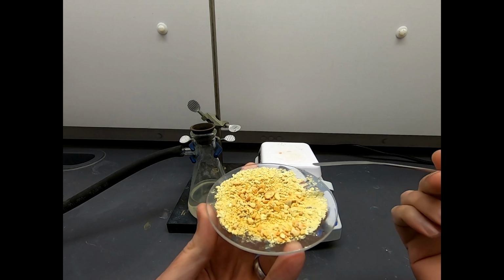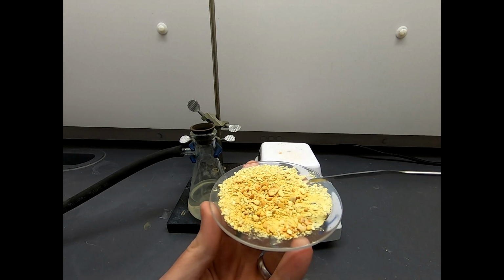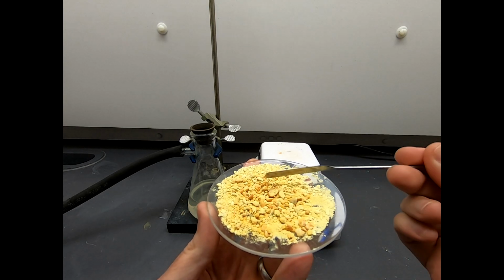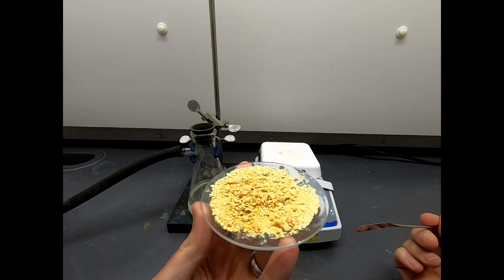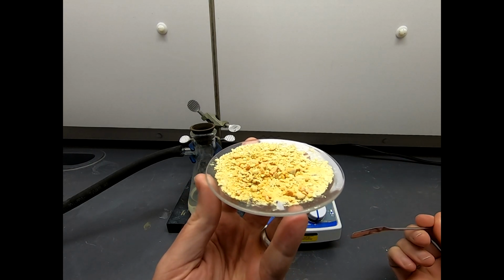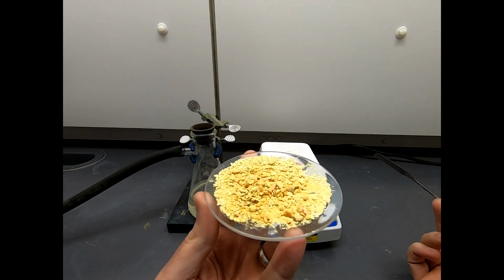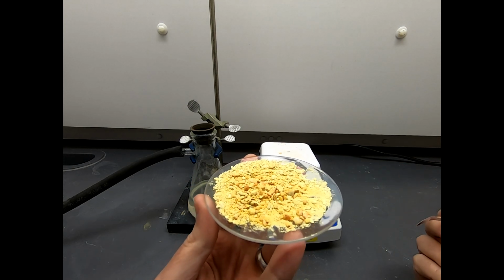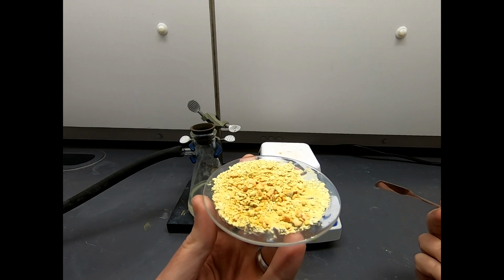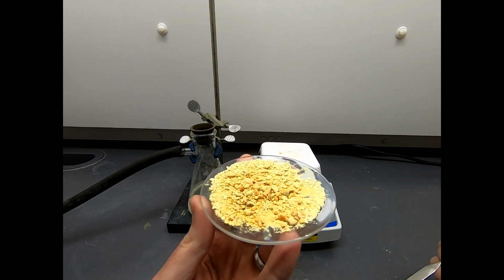This is 8.997 grams, so just a hair under 9 grams. This is going to be a good yield, which is not surprising based on the literature procedure that I've been following. But now we need to see that this looks like a good yield. We'll need to calculate a yield, but of course first we'll need to confirm that this material has good purity. So next will be a TLC, melting point, and an NMR spectrum.